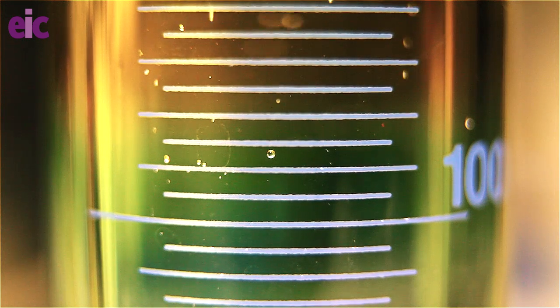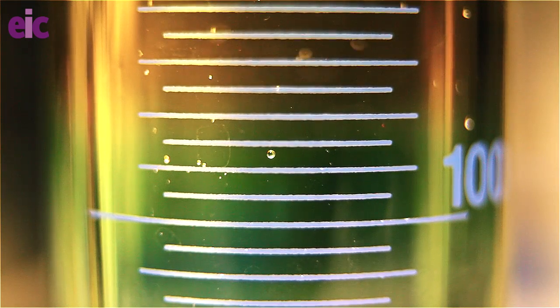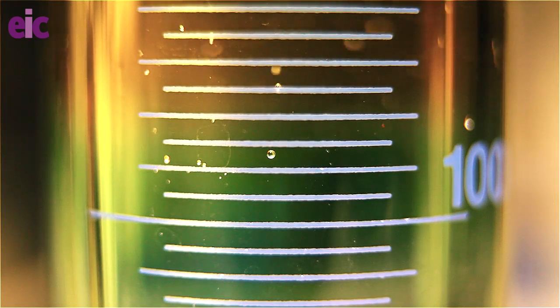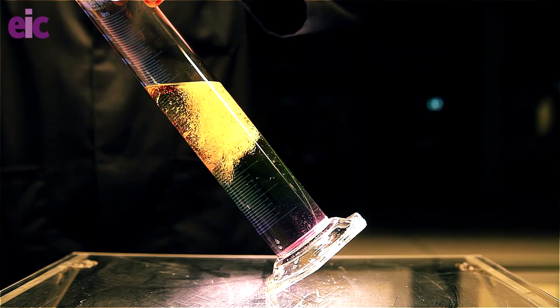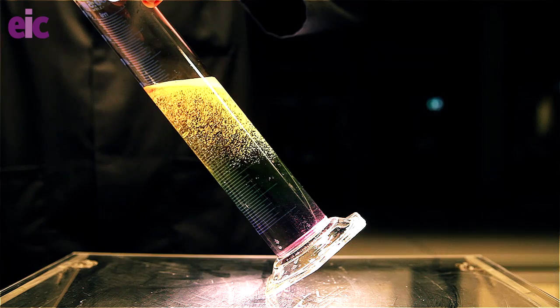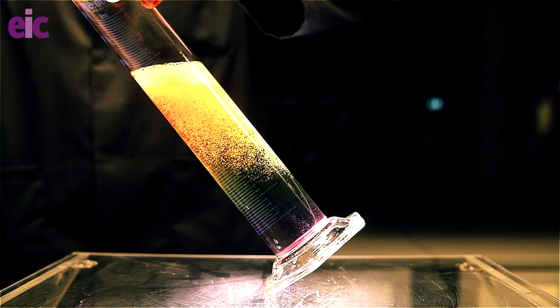Now this brings us to our final point. Of course, if you have a weak base reacting with a weak acid, then you're in trouble, because you never really get that full, steep part of the pH curve that you need. Essentially, you're going to need a different technique to do your titration, perhaps with some kind of a pH probe.